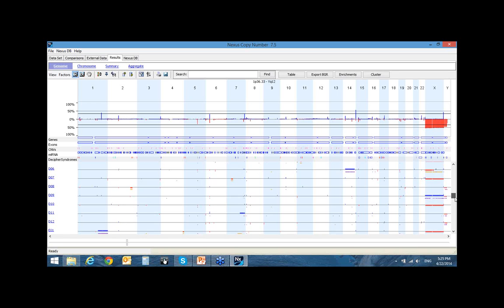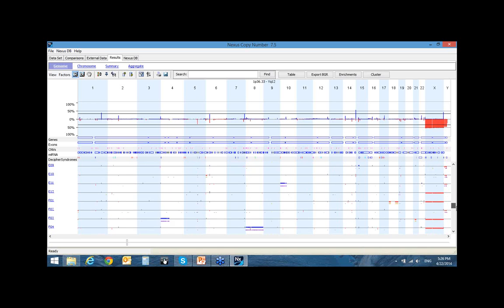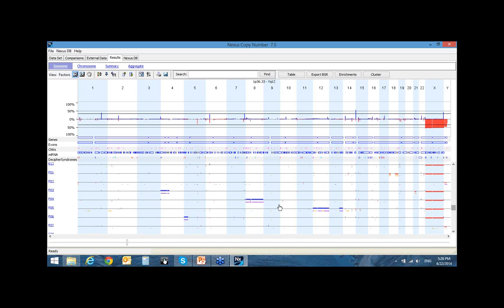So you scan through the entire region. Like here, we have an ROH. There's no copy number change. This is the copy neutral ROH. You can easily identify these using the filter function, which I'm going to touch upon later. But right now, as you can see, you can quickly scan through what's going on with your plate. What kind of events, big events like this one, trisomy 8, and there's trisomy 12, you can easily identify.